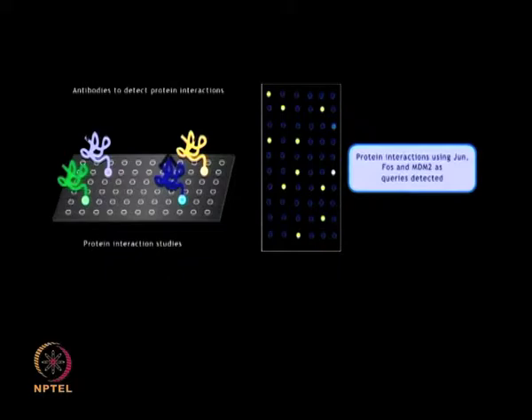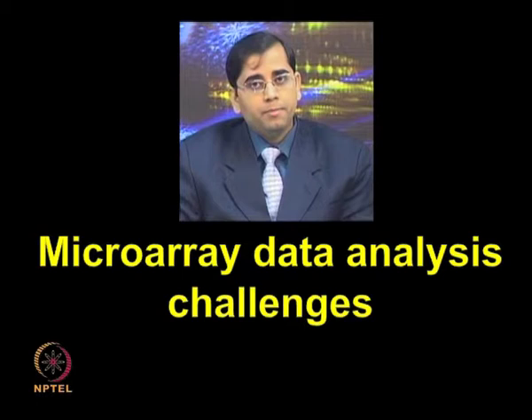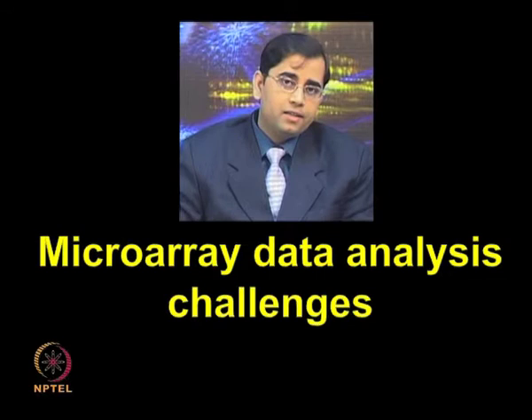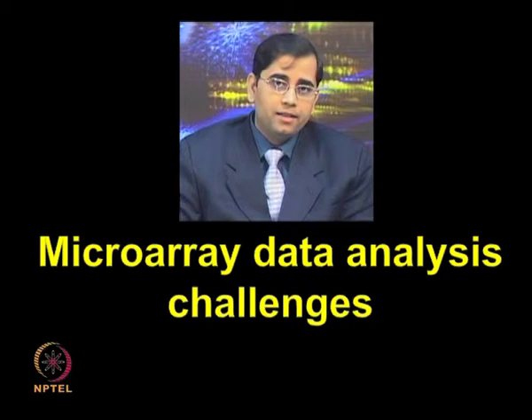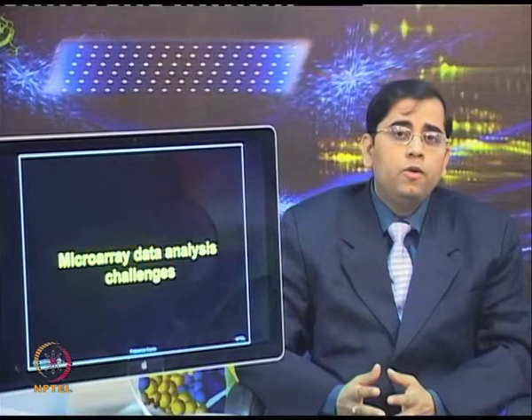So, now we have seen the overview of how protein microarray experiments can be performed. We have looked at various applications by employing cell-free expression based protein microarrays. We have discussed biomarker screening, immunological studies and protein-protein interactions. Now, regardless of what application you want to perform on these arrays, you are going to generate a large amount of data. The volume of data generated from a microarray experiment is prodigious. It becomes important to develop the appropriate informatics system so that one can analyze this data uniformly and get very good output from this whole analysis.